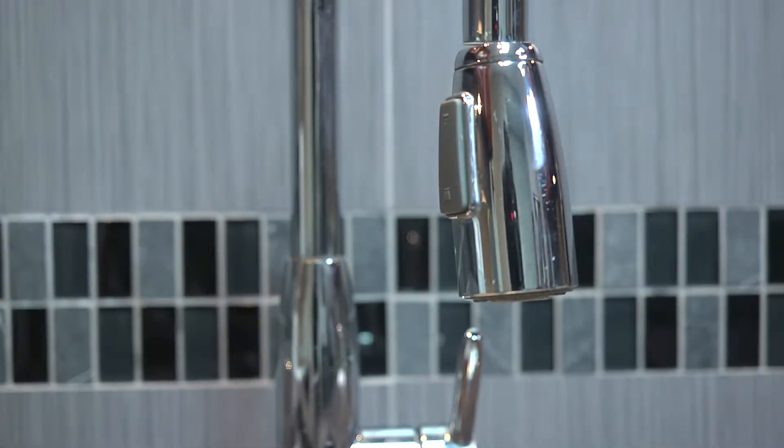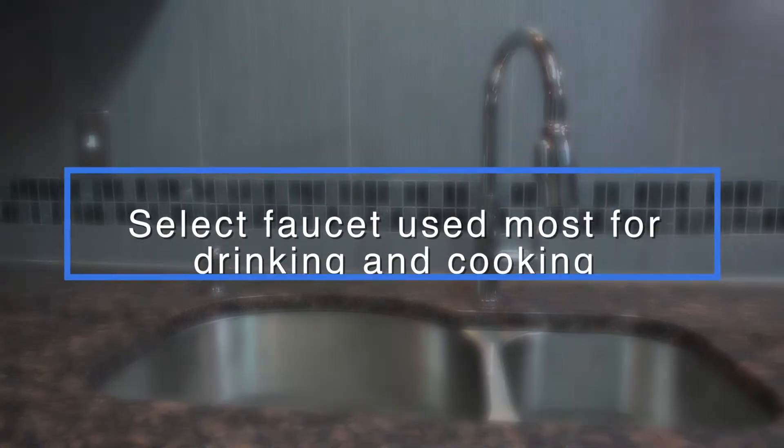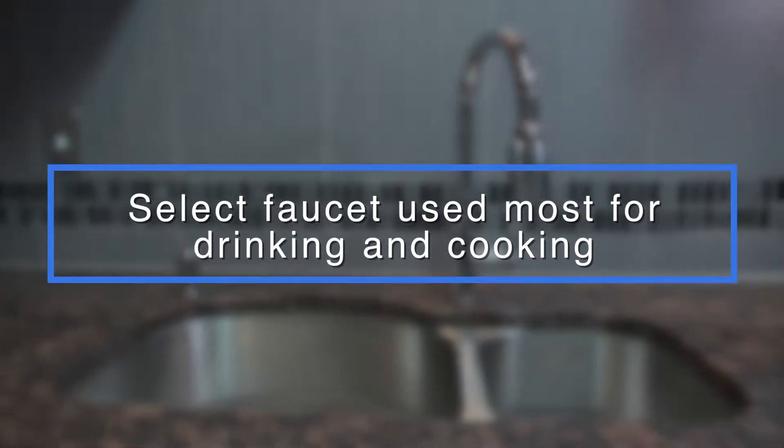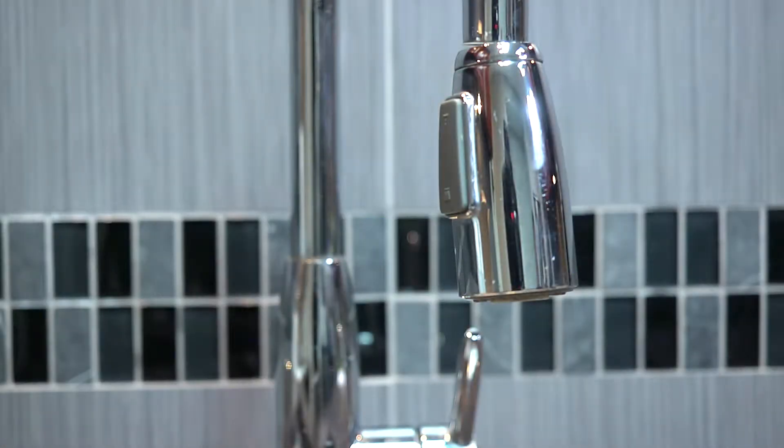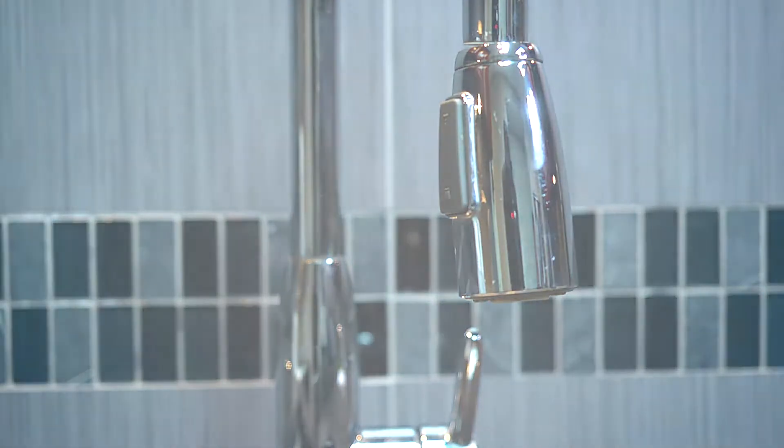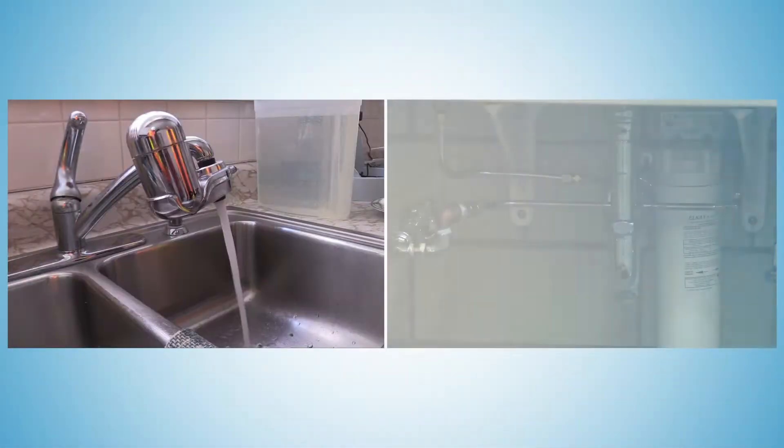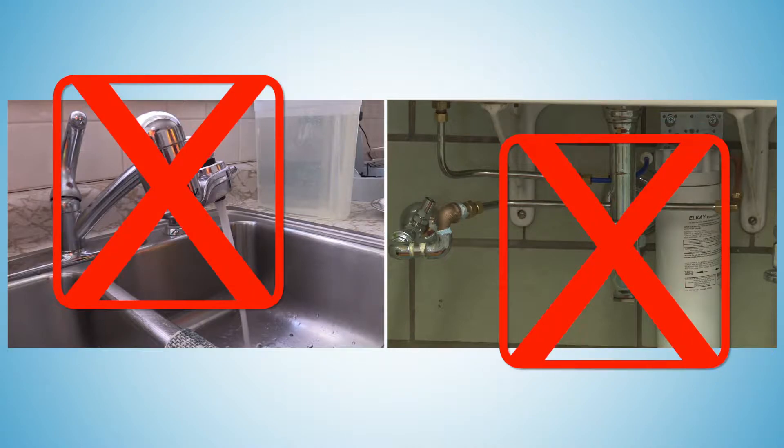Before you collect your water samples, select the faucet in your home you most often use for drinking and cooking. For most that's the kitchen faucet. Make sure there's no water filter on the faucet or under the sink, and do not use a faucet connected to any type of home water treatment system.